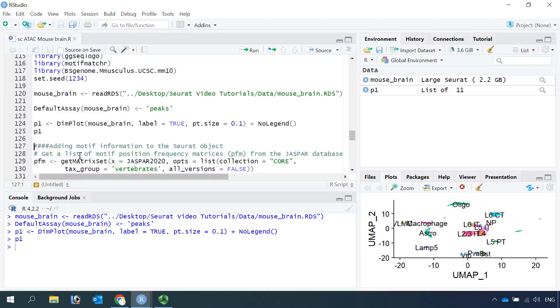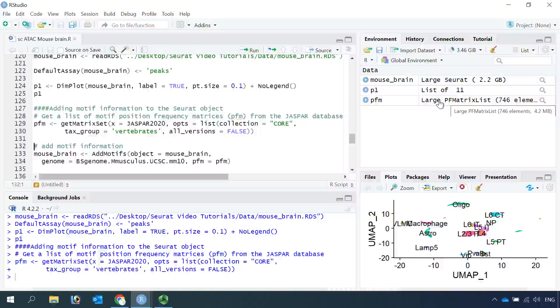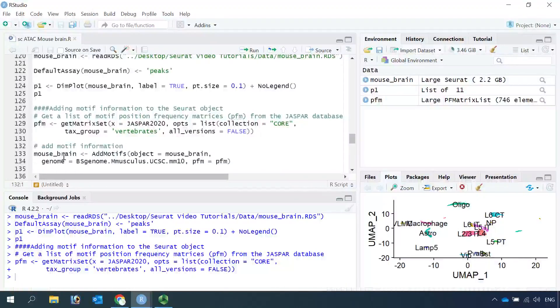Now we can add the motif information into the Seurat object. First, we get a list of motif position frequency matrices from the JASPAR database. So let's go ahead and get the matrix set. You can see here in the position frequency matrices data frame, we got 746 motifs. So now we can add the motif information into the Seurat object.